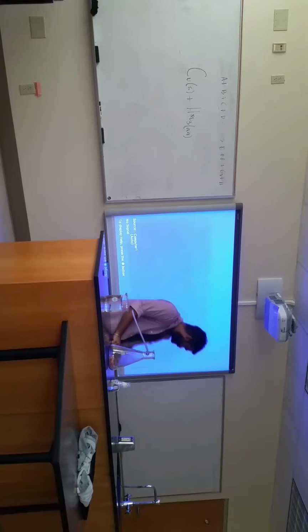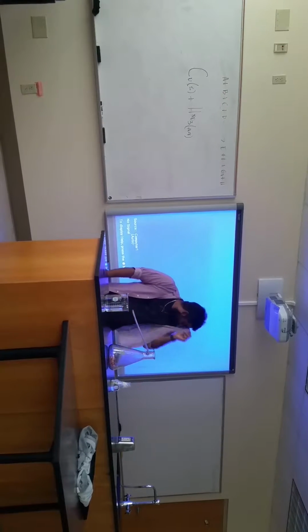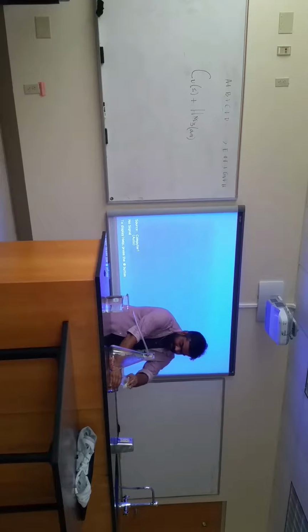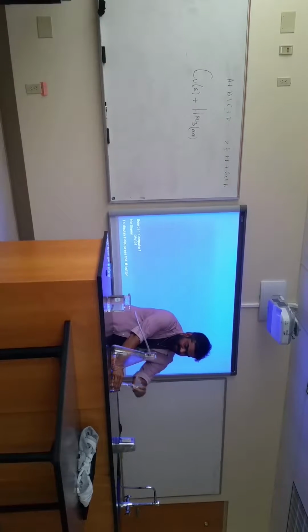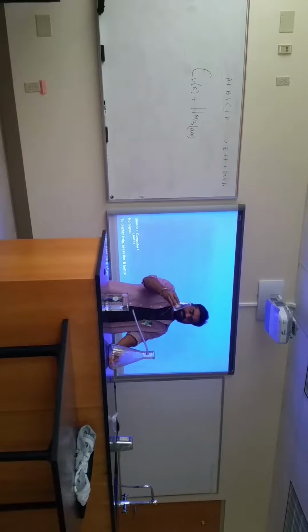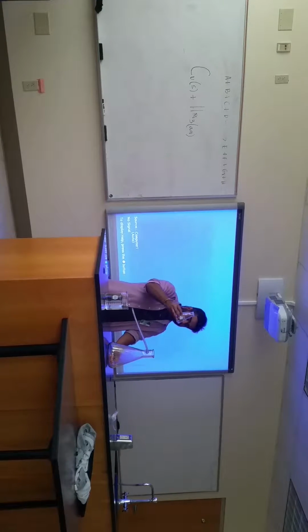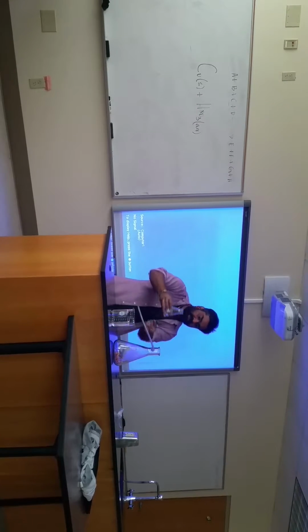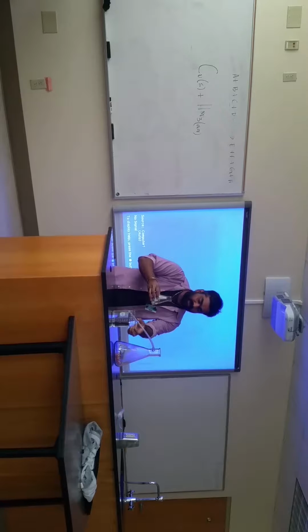So, I got my eye goggles, so it's okay. Hopefully nothing happens and I go home in one piece. So I'll add concentrated nitric acid. This is not diluted. This is pure concentrated nitric acid. I'm going to put this in here and put this in a beaker of water.